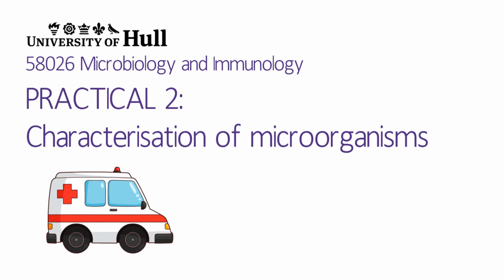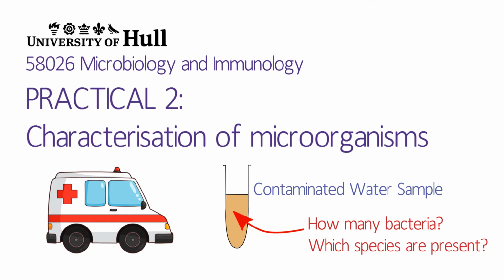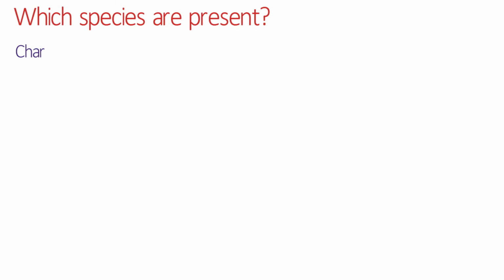Remember that vomiting bug on campus? People are still getting sick, so we need to work out what the bacteria responsible is. In the last lab class, we plated out bacteria from the contaminated water sample using aseptic techniques. In this lab, we'll try and work out which bacteria are present in the sample using a few different approaches.